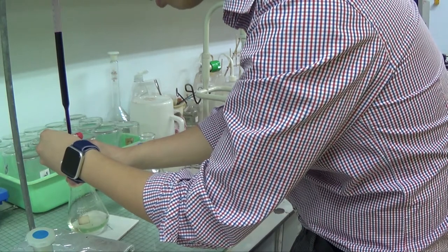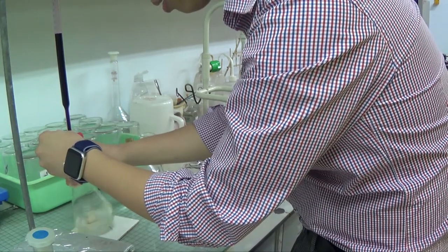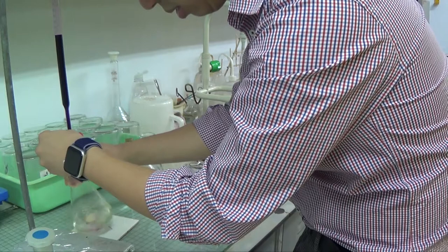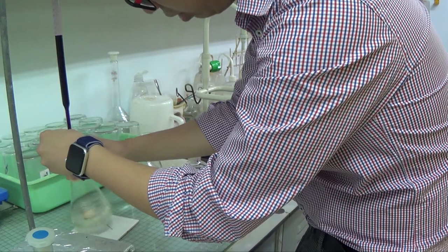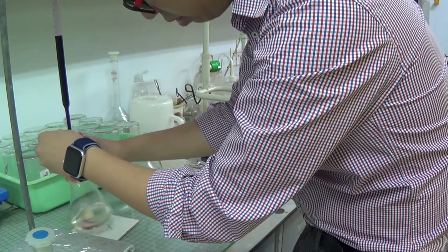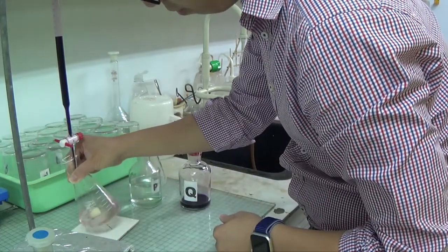So open the valve slowly, drop, drop, drop, drop, drop. It hasn't turned. One drop and it will turn. Not yet. Not yet. And we have reached the end point.